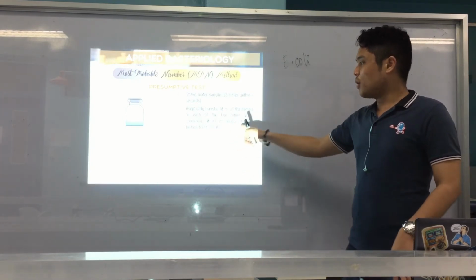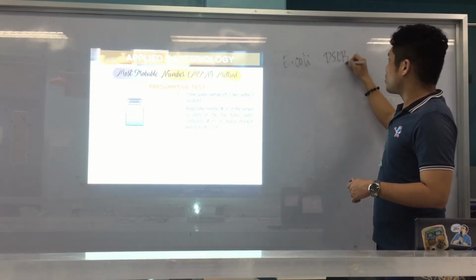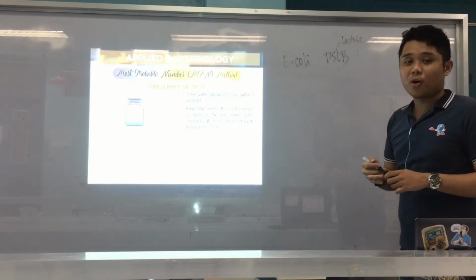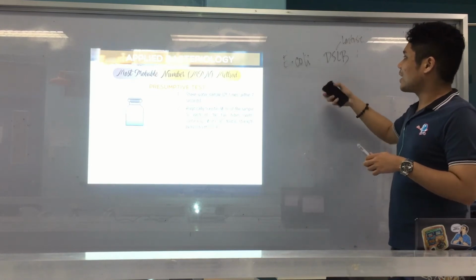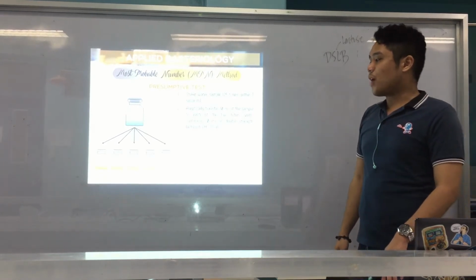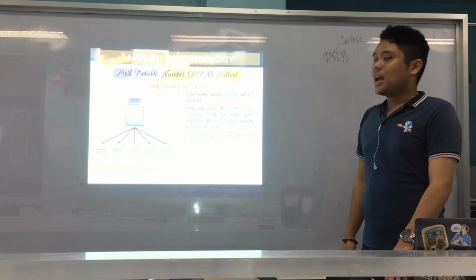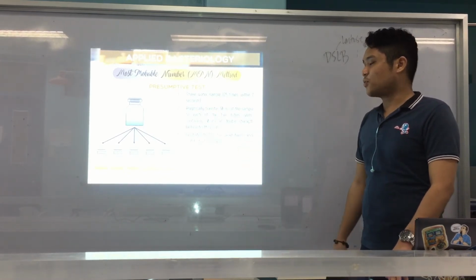You dispense into double-strength lactose broth, DSLB. It has lactose because, as mentioned, coliforms ferment lactose, so we are looking for organisms that ferment lactose. You distribute to 5 vials, putting 10 ml in each, and then incubate at 35 to 37 degrees for 24 to 48 hours.